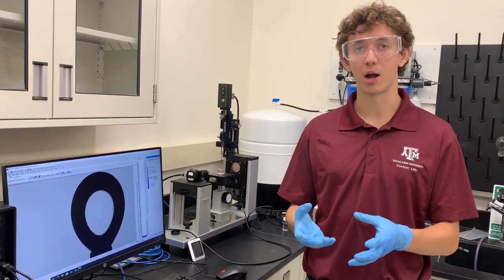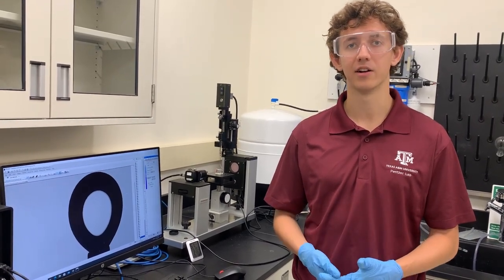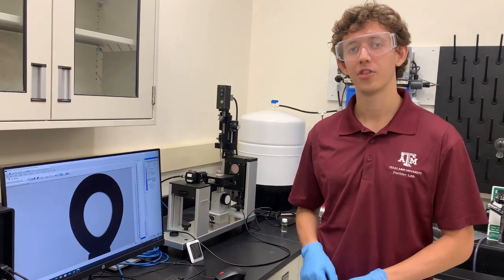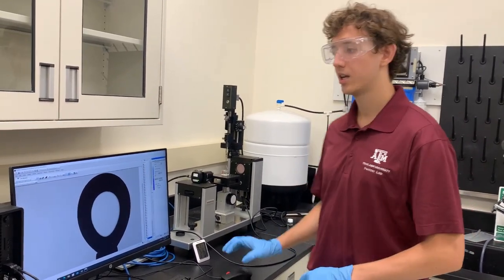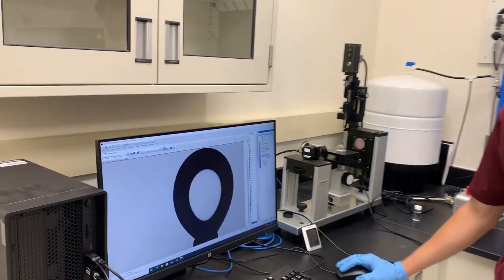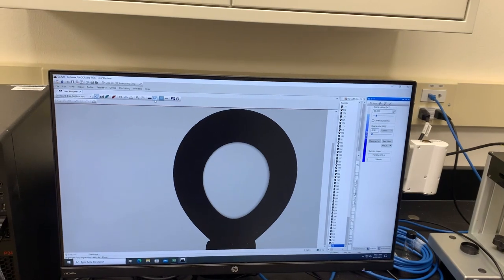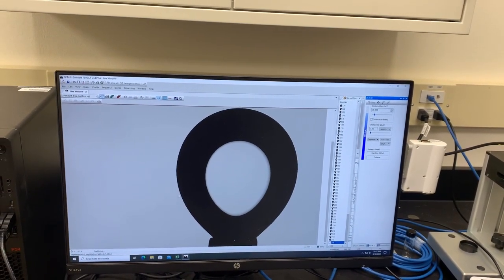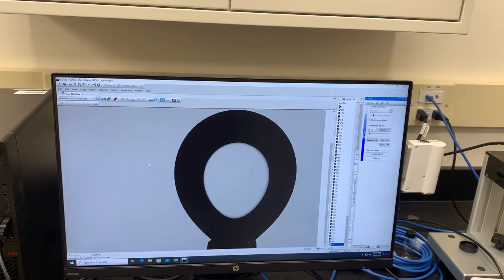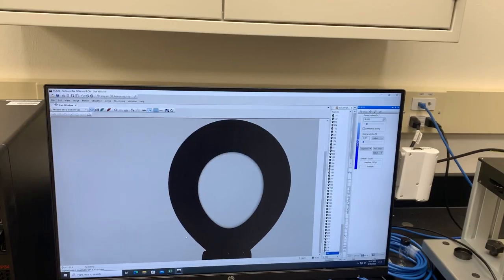The larger your droplet and the greater the magnification factor of your camera is, the more accurate your interfacial tension measurement will be. Now, to calculate the interfacial tension, we use the Laplace-Young equation, which traces the outline of the silhouette between the droplet and the continuous phase and outputs your interfacial tension.